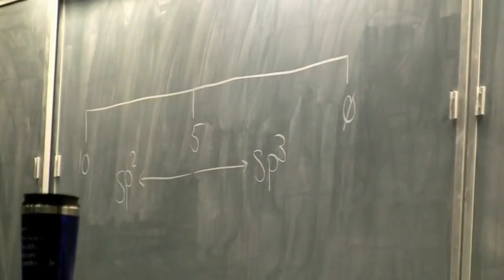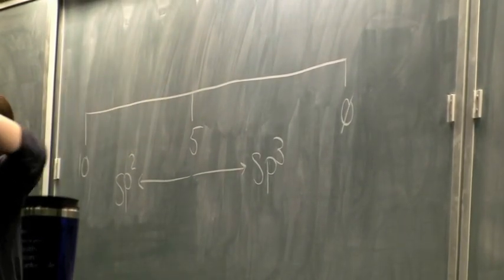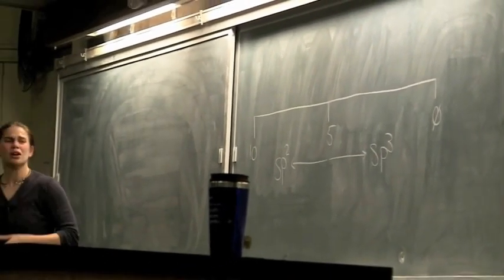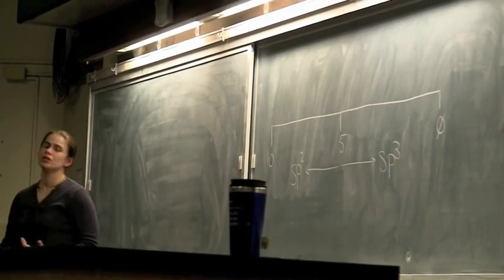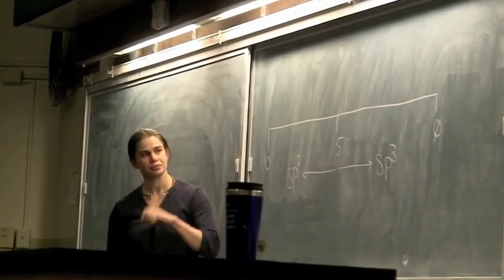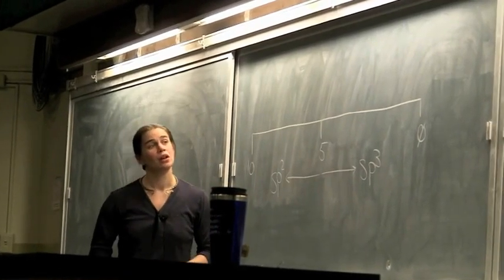You can get things that have 2 electronegative groups at 5.1, and they're still sp3. You can get alkenes at 4.8, and they're still sp2. But as a rough estimate, you can really see mostly sp3 to the right, mostly sp2 to the left. Upfield for sp3, downfield for sp2.